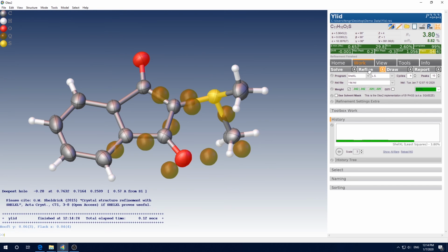I'm very proud of you as you have come so far. Obviously, this is a very straightforward dataset, so there are no challenges here. In real life, you will run into all kinds of problems. But don't panic. About 50% of the time, the structures are like this, so you can process them by yourself now. For more challenging ones, I will try to make a series of demos to teach you how to deal with them.